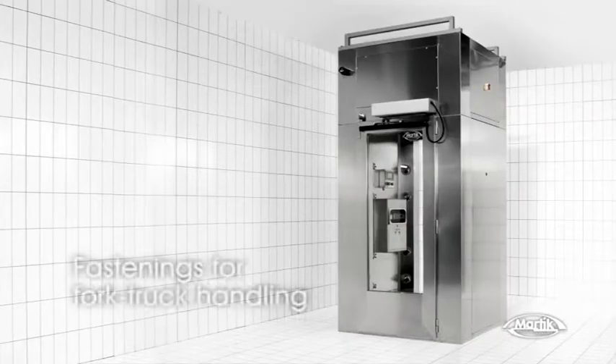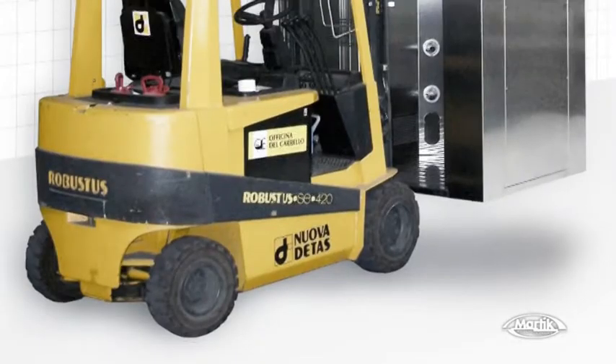The top of Airtek is equipped with fork fastenings to allow user-friendly transport of the whole unit by forklift.